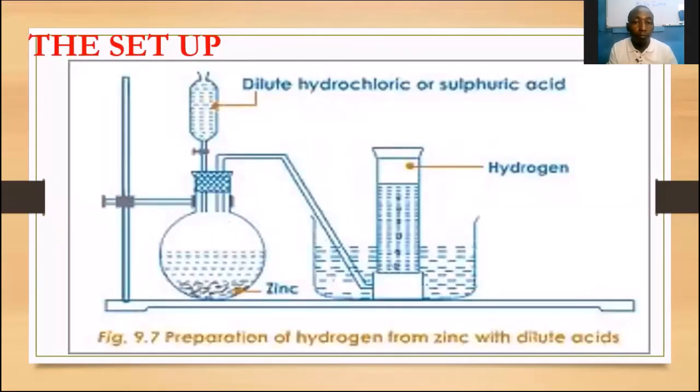The setup, my student: you can see there a dropping funnel with the dilute hydrochloric acid. You can as well decide to use sulfuric acid, no big issue there, but we're using hydrochloric acid and zinc.